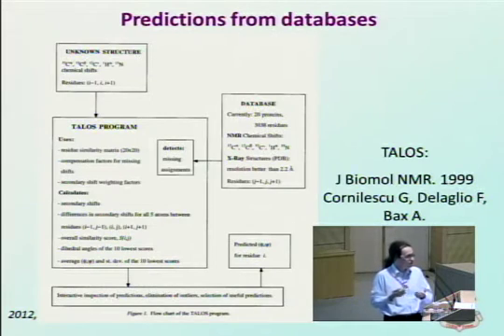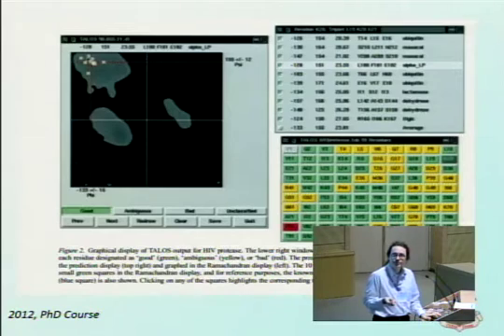And this is very useful because it has various advantages with respect to both the CSI and J couplings. With J couplings, the advantage is you don't take additional measurements, because you just take the chemical shifts from your resonance assignments that you have to do nevertheless. And with respect to the CSI, the dihedral angle values that you get here are much more precise than the generic assignment to either alpha helix or beta sheet. Here you are really getting values for the angles.